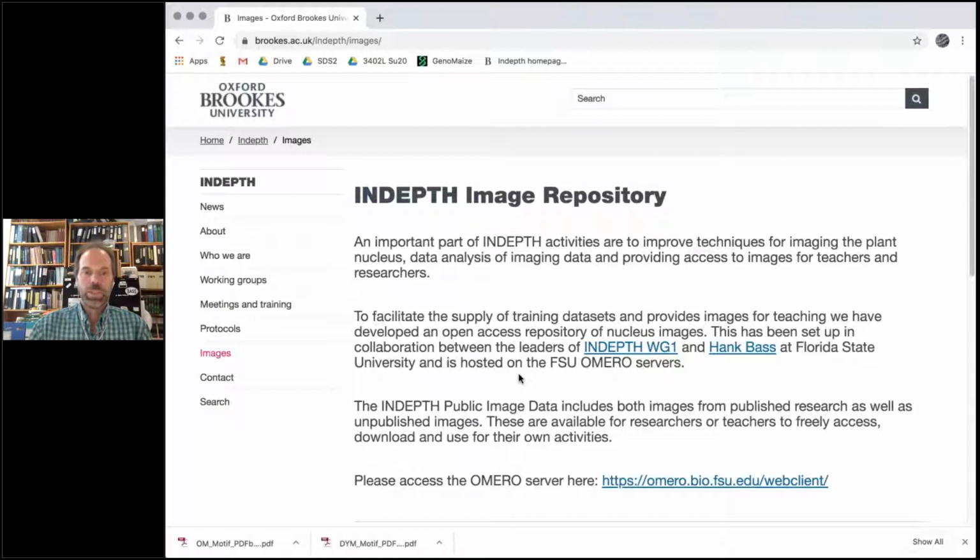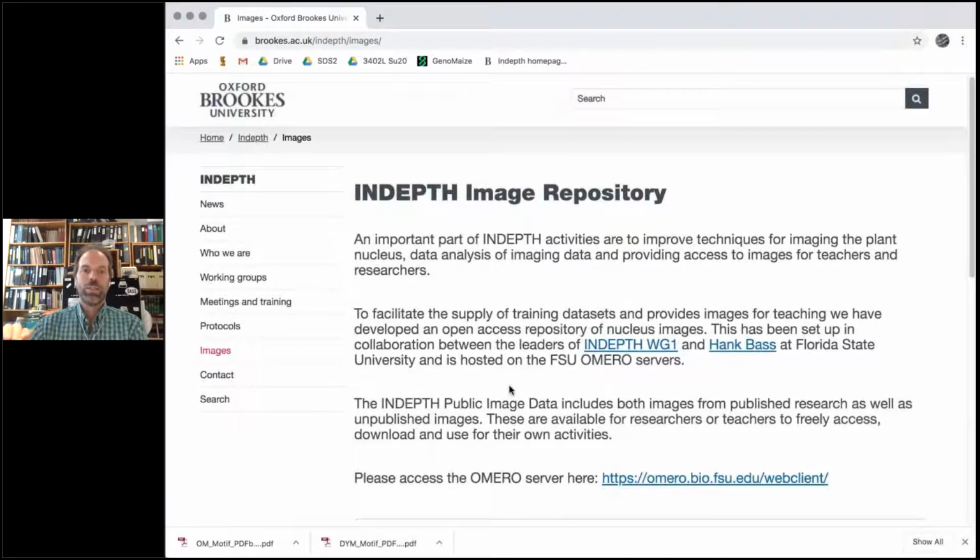browser. So what's nice about this system is it's set up to be easily accessible, and this is so that people can view image data from publications or for teaching purposes. And it functions as an interactive repository, kind of like a sequence database where you can store images instead of sequences, and you can access them. So I just wanted to show you what it looks like and how to navigate particular images in a way that allows you to view and scale and change the colors. And you can even download data for subsequent reanalysis if you like.